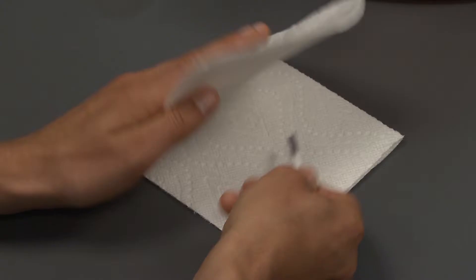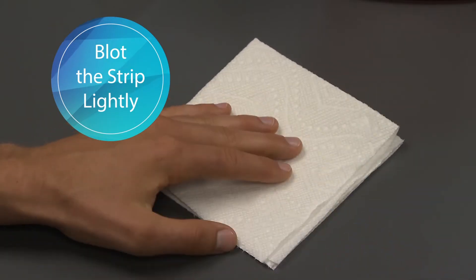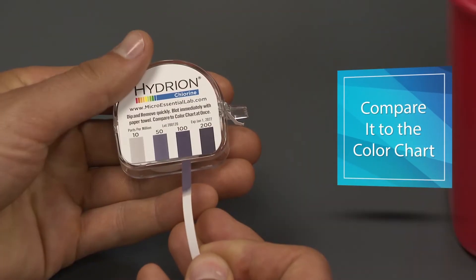Remove the test strip from the solution and blot it lightly with a paper towel. Compare the color on the strip with the kit's color chart.